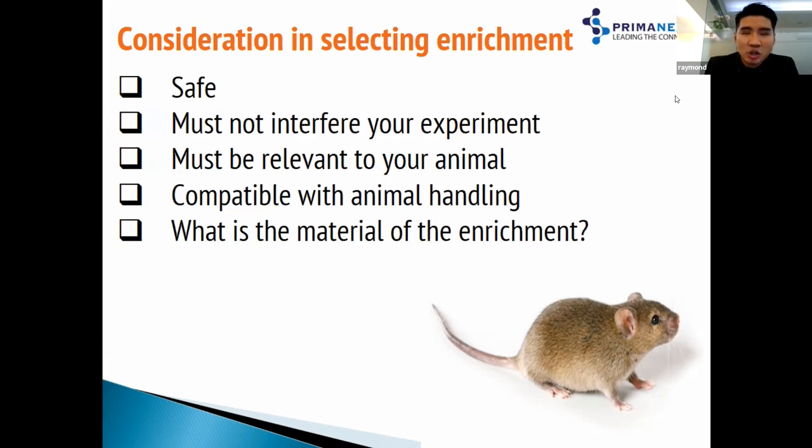Second, it must not interfere in your experiment. Take for example, if you are studying something, you would not want any interference in your experiment. Otherwise, it's going to be worse because you are not going to get your hypothetical question answered.